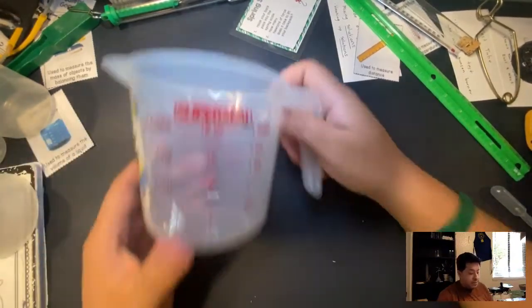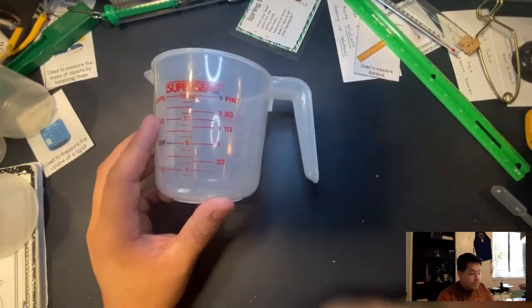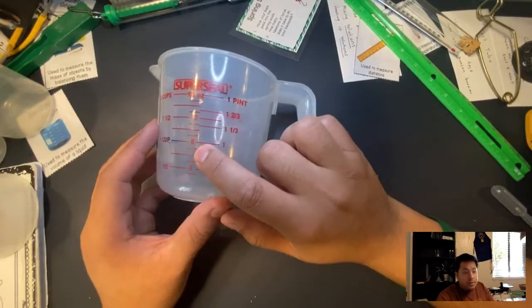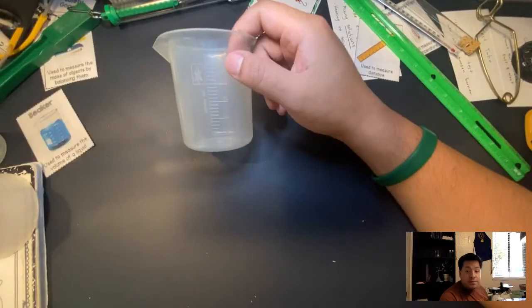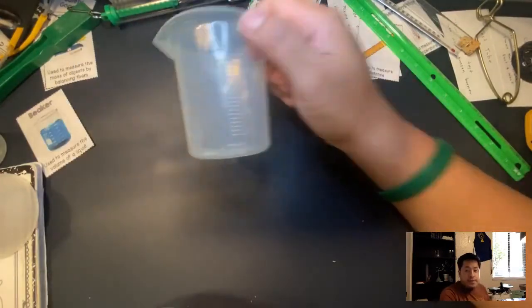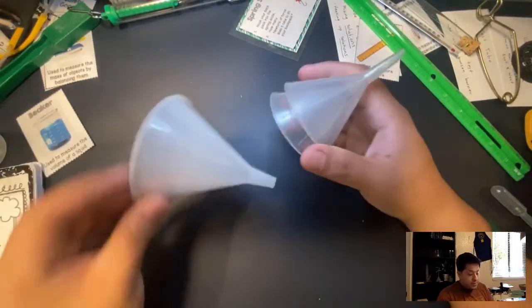Another science tool — a measuring cup. Most of the time we're going to use beakers, but if things get too big we'll use a measuring cup. This one goes up to 500 milliliters and the other goes up to 250 milliliters, so two of the smaller ones equal one of the larger ones.